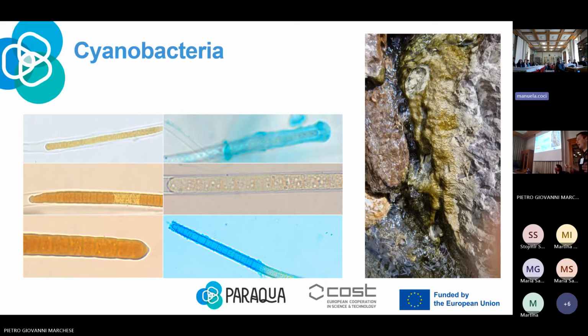And the heterotrophic bacteria can quickly overgrow the culture. Therefore, this process is quite difficult and time-consuming, and we have to spend a lot of time on isolation.